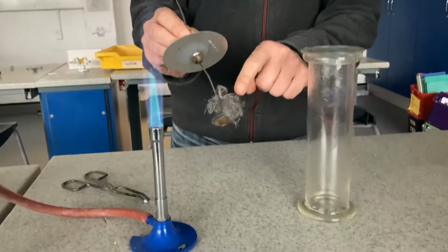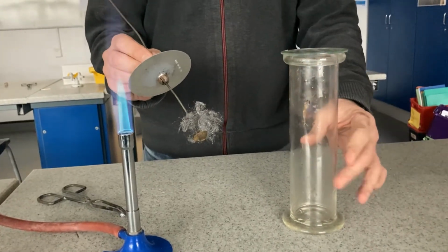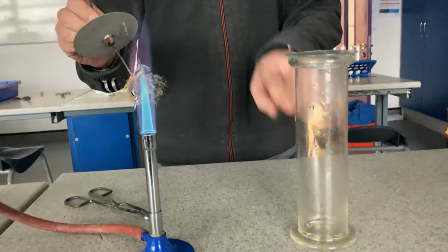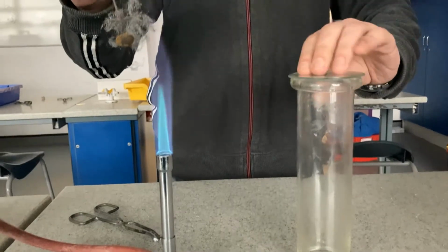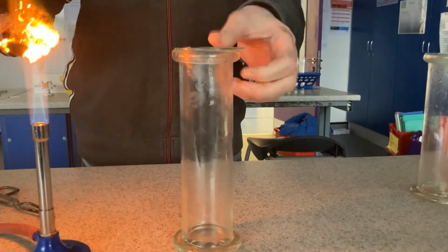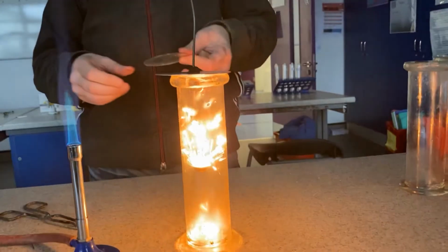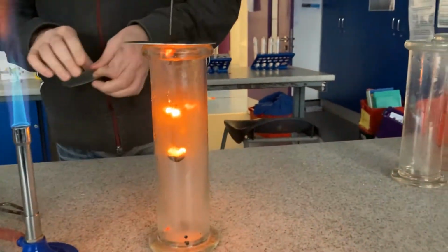Okay, so I've decided to get some iron wool, and we've seen what that's like. It burns quite well when it's very thin, but I'm going to burn it in oxygen, which has got a lot more oxygen than air. Oxygen is 100% oxygen. The air is only 20% oxygen. So I'm going to heat it up here, and I'm going to pop it straight into the oxygen. Gotta be quick. Don't mess it up. Ready, steady, go. Yep, that burns a whole lot better. No messing about.